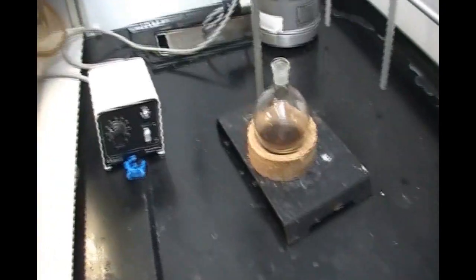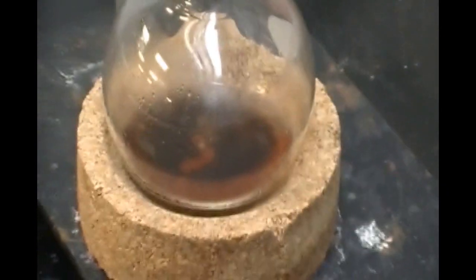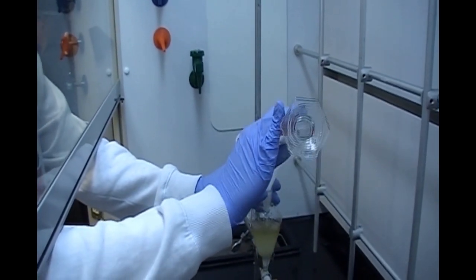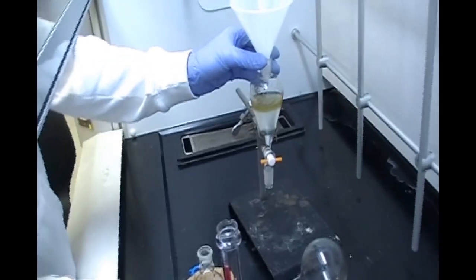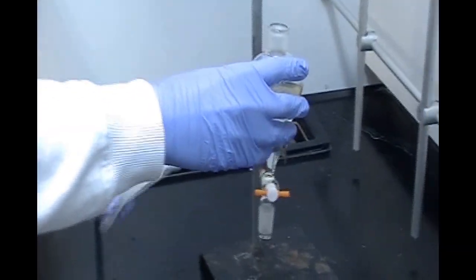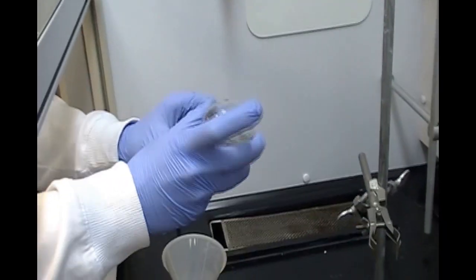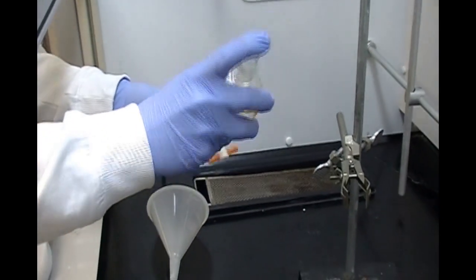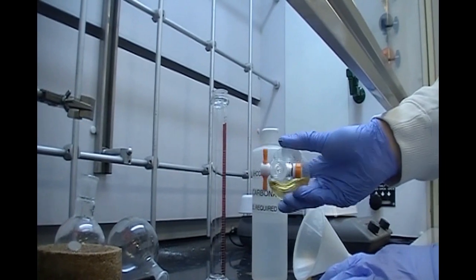Once finished, and the product had cooled, we moved the product to a separatory funnel, leaving the boiling chips behind in the round bottom flask. Here, we washed with 50 milliliters of water and drained the aqueous layer. Be sure to vent frequently. Pressure builds quickly and the funnel can explode if one isn't careful. If you listen closely, you can hear some of the air exiting the separatory funnel now.